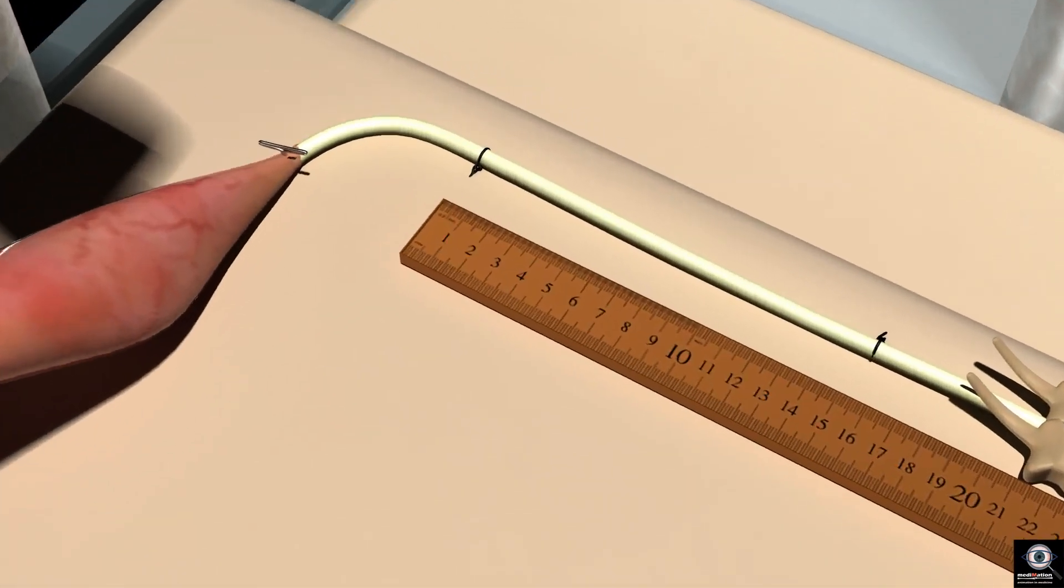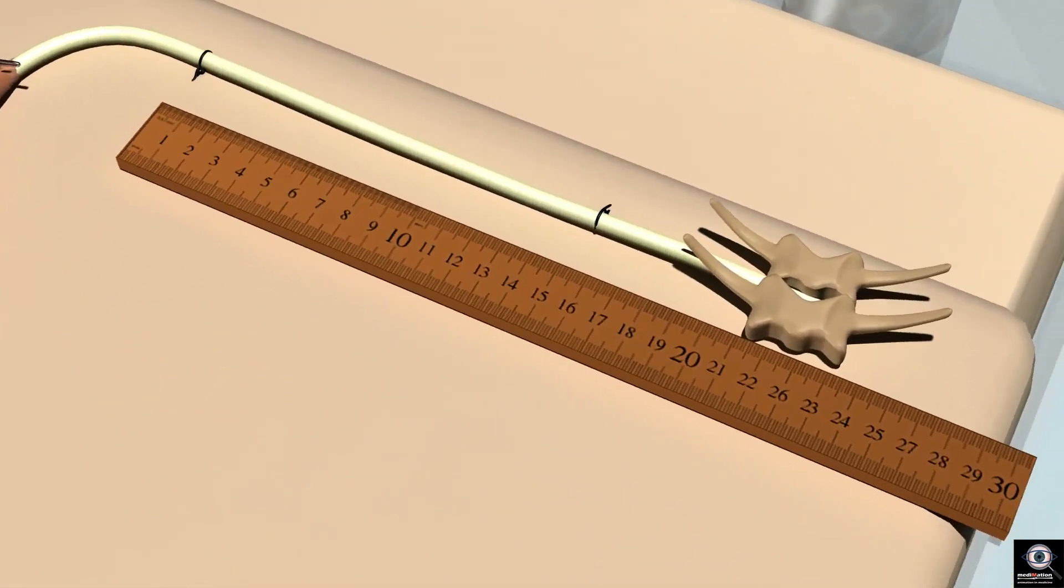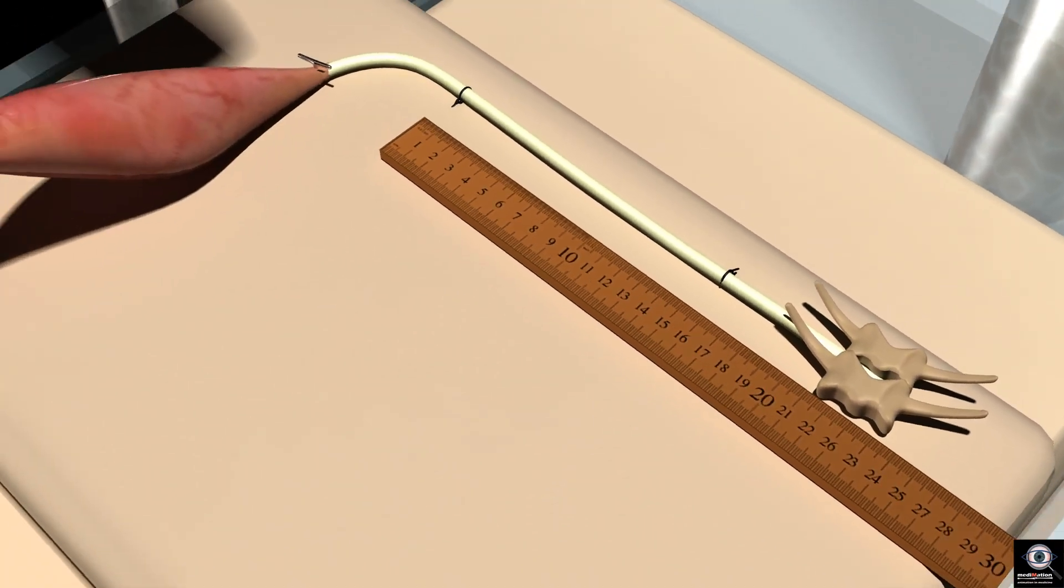We measure the distance between the two points of stimulation on the nerve accurately. We can now use the graph to calculate the velocity of conduction of the nerve.